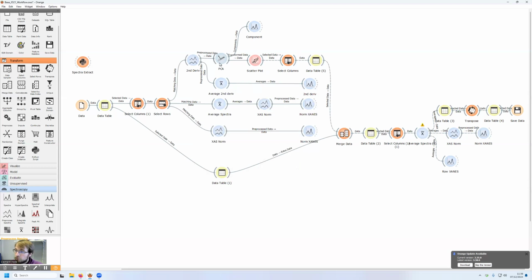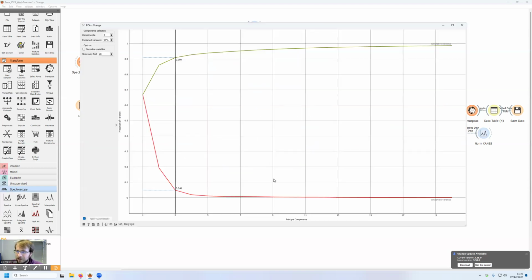The next step is the PCA. The PCA is implemented automatically, and you can see here the variance explanation, so the curve of the PCA. The first principal component here, in the case of the dataset that we selected, already explains something like 67% of the variance. Then the second one is a bit below 20%. The third one is at 4.8%, etc., etc.